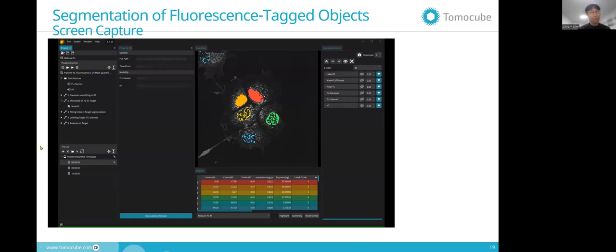It's very straightforward. Here I intentionally set a value too high for these images. You see that the nucleus is stained. Here you can see some of the nuclei are filled with no spots in the middle, but some of the areas look very spotty.